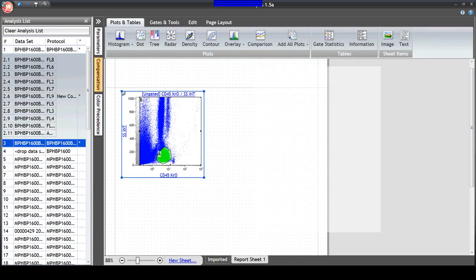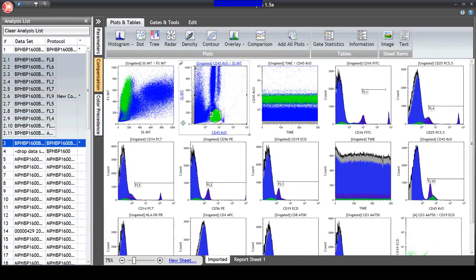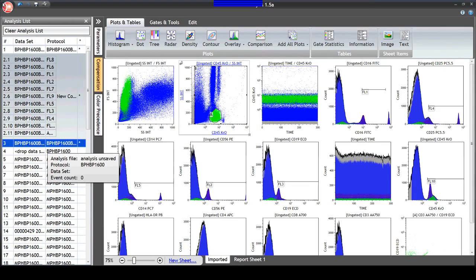And it means that when I move something on this dot plot, it's also changed on my original. So it's a way of linking together gates across pages. All right. So I will create a report sheet that gives me a down and dirty, something that maybe the client needs to know how the sample will they proceed with the next collection on that particular individual.